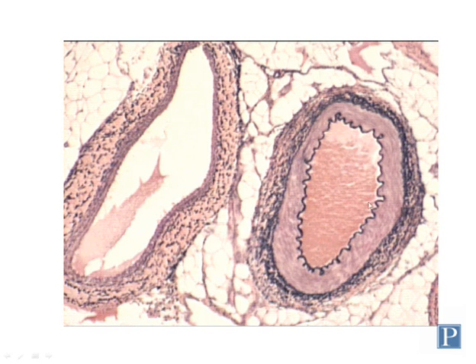Medium arteries vary pretty considerably in the width of the muscular layer of the wall, and based on the table in your lab manual, they have between about 10 to 40 layers of smooth muscle in the tunica media here. The tunica media of the small vein is much smaller in comparison. The outer layer, the tunica adventitia, is very well developed in veins, and you can see some elastic fibers in the tunica adventitia, both of this medium vein and the medium artery here.